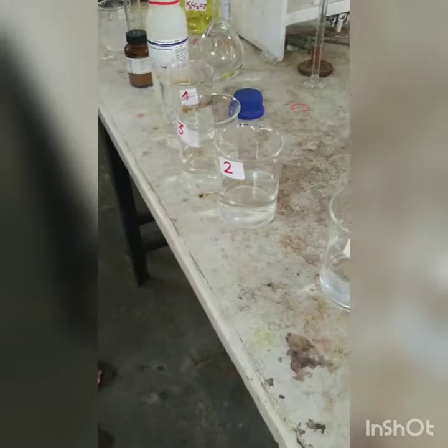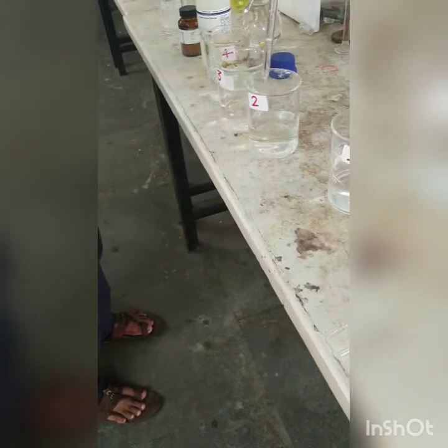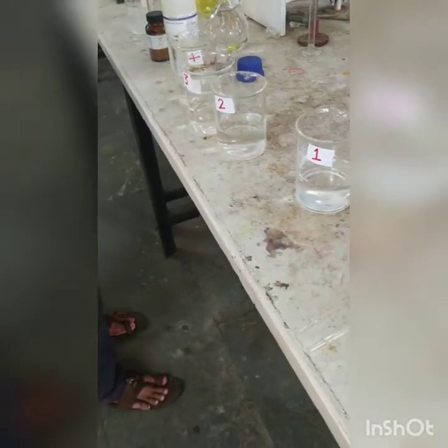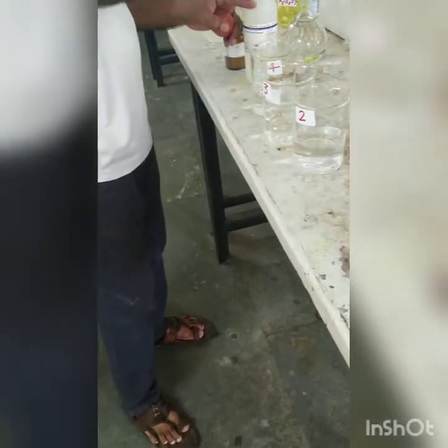So as he has got practice, he will stop at each ml after adding 1 ml. But otherwise it is better to take 1 ml and then drop it. But if you have sufficient practice, you have control on the pipette that is being used, then only it is possible. Then add a few crystals of KI.